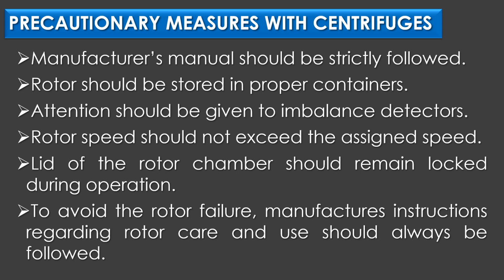Fourth, rotor speed should not exceed the assigned speed. Fifth, lid of the rotor chamber should remain locked during operation. Sixth, to avoid the rotor failure, manufacturer's instructions regarding the rotor care and use should always be followed.